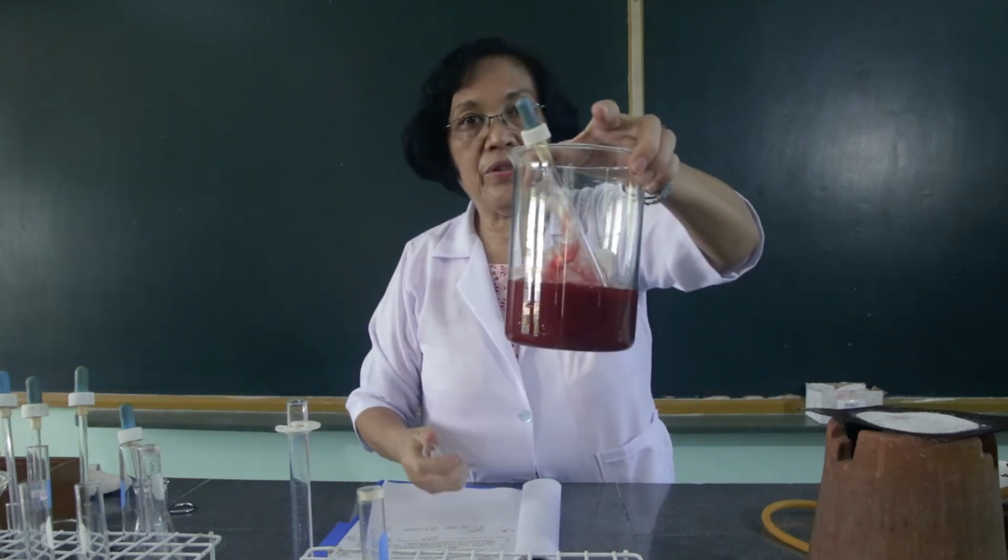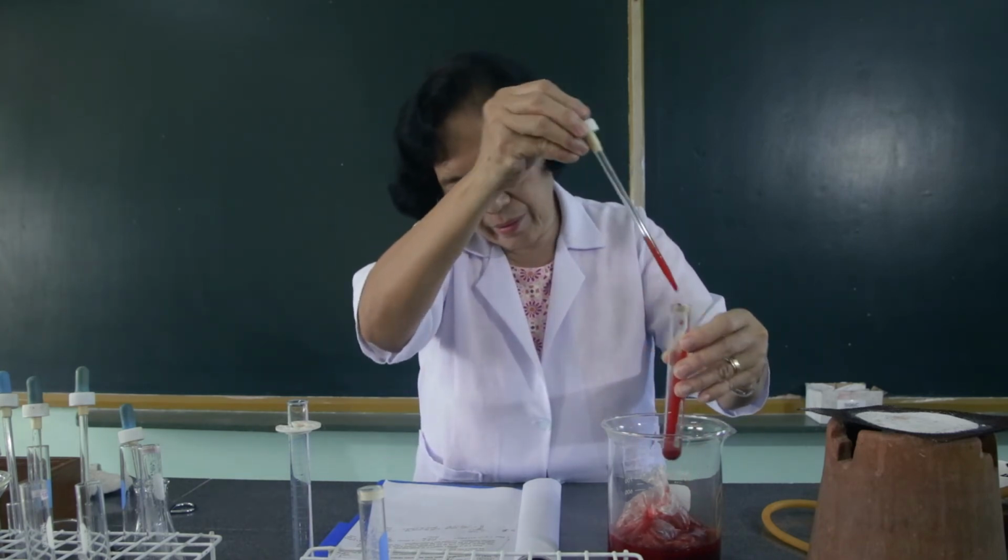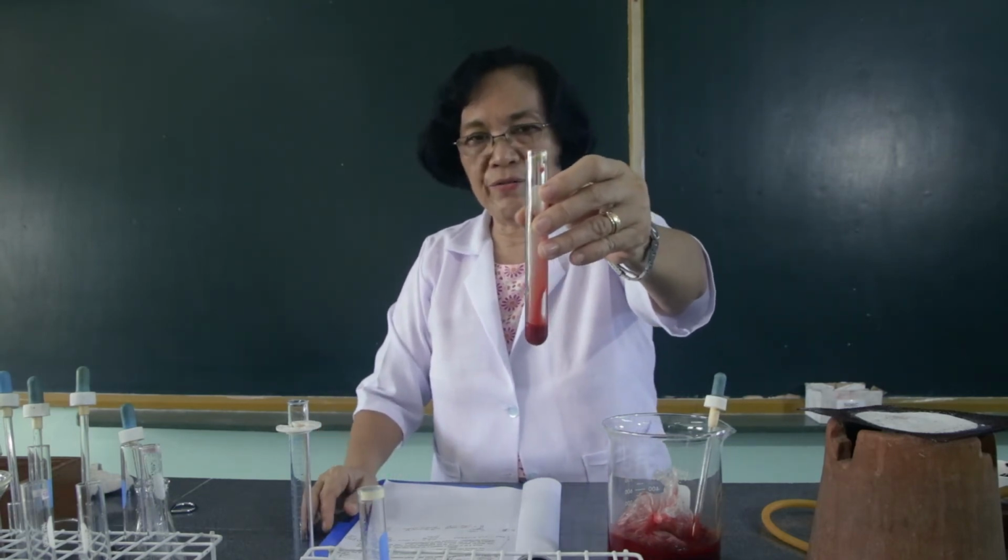And the last test that we are going to apply to the blood is the test for oxyhemoglobin and the reduced hemoglobin. So we will use 2 ml of the blood. And we're going to add to this 5 ml of water.